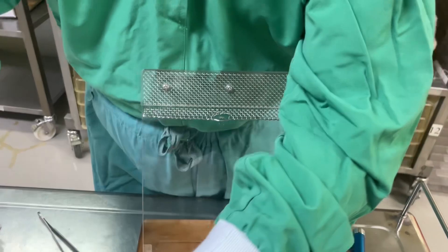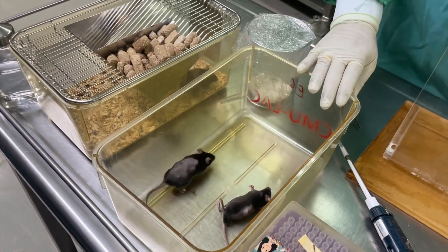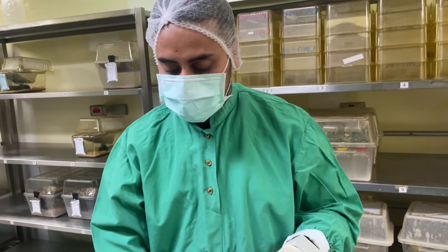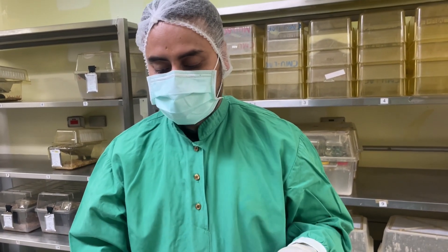Release the drug slowly, and you will hear a punch sound — that means your administration is done. Take it out slowly and keep the mouse for observation for one or two minutes. If the mouse's heart rate and movement are fine, it means the mouse is healthy and you did not hurt the intratracheal tube.